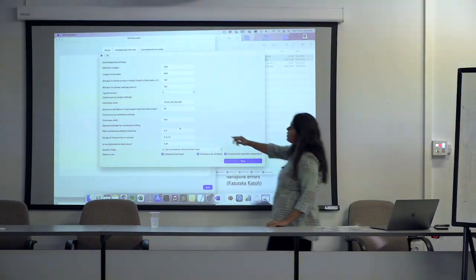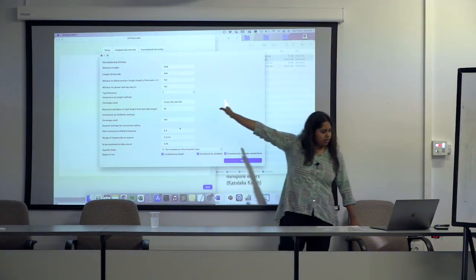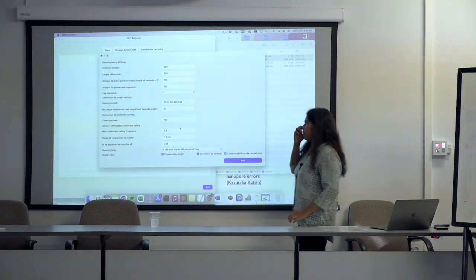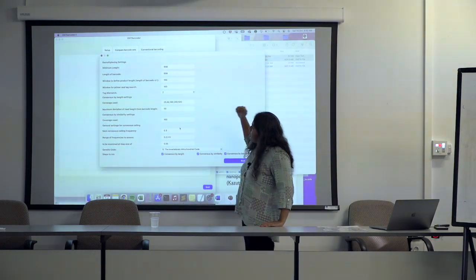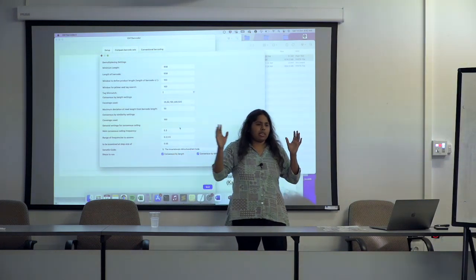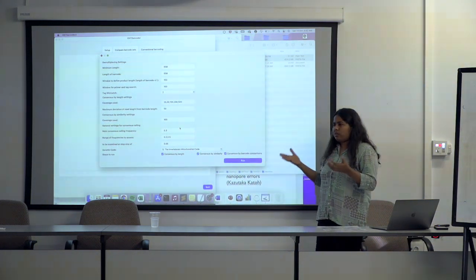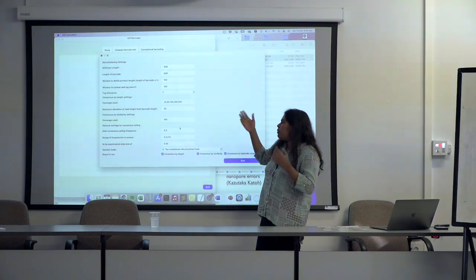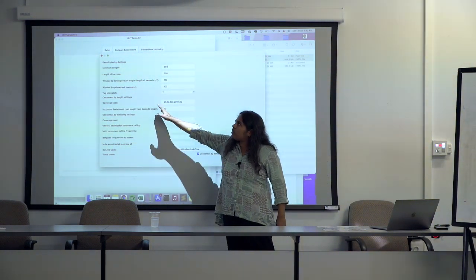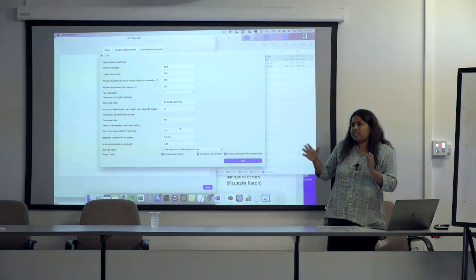So here you can see that when we established the coverage to be used, we did a series of values, which was an iterative coverage mode. One of the reasons for this was that we noticed that excess coverage in ONT was actually deteriorating the barcode quality, because the large number of reads tend to create more noise. When we compared the results between something like 200x and 1000x, we would never really see an improvement.